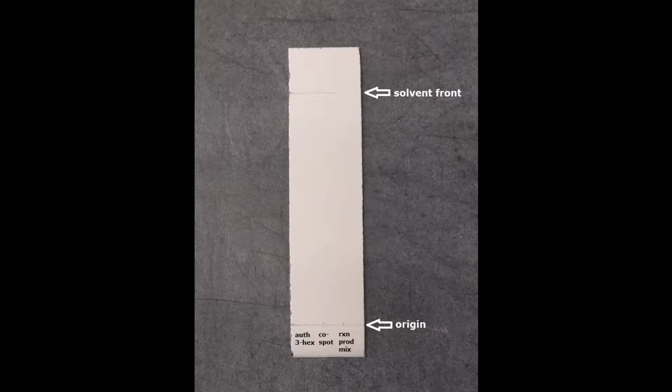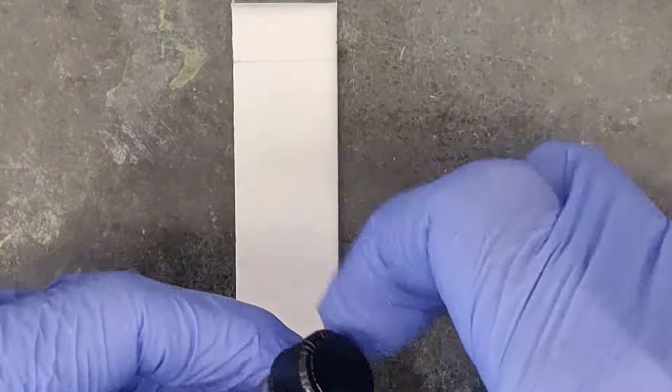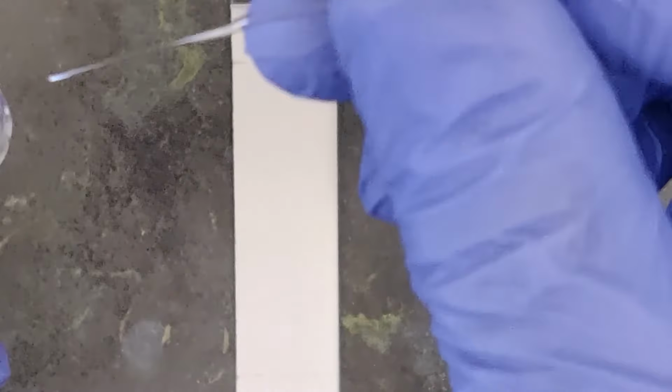For this demonstration, at the 3 marks placed along the origin will be spotted the product mixture from the hydration of 1-hexene at the far right, an authentic sample of 3-hexanol purchased from a chemical supply company, spotted at the far left, and in the middle will be co-spotted both the product mixture from the hydration of 1-hexene and the authentic sample of 3-hexanol directly on top of each other at the same location at the origin. Standard solutions of authentic 1-hexanol, 2-hexanol, and 3-hexanol dissolved in volatile solvents like dichloromethane will be available for use.